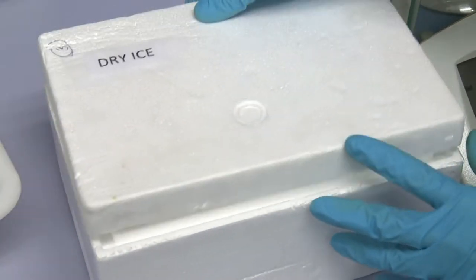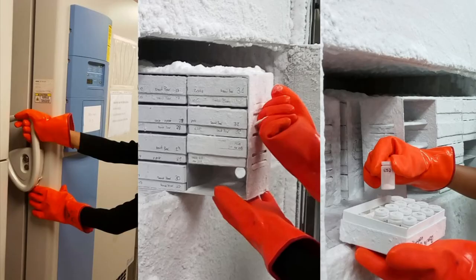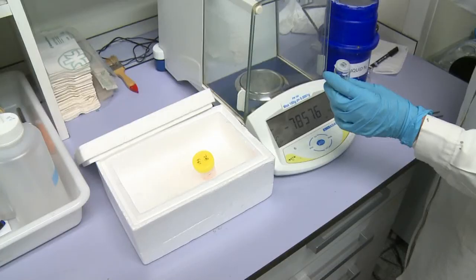Store the weighed sample in glass vials at minus 80 degrees Celsius. You can preserve the remainder powder in a plastic tube for further analysis.